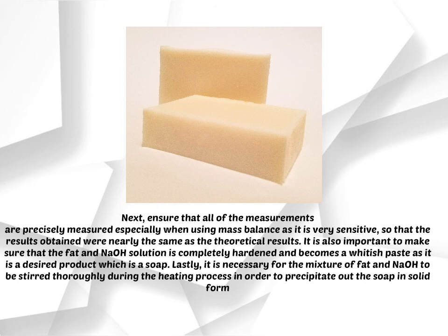It is also important to make sure that the fat and NaOH solution is completely hardened and becomes a whitish paste, as it is the desired product, which is soap. Lastly, it is necessary for the mixture of fat and NaOH to be stirred thoroughly during the heating process in order to precipitate out the soap in solid form.